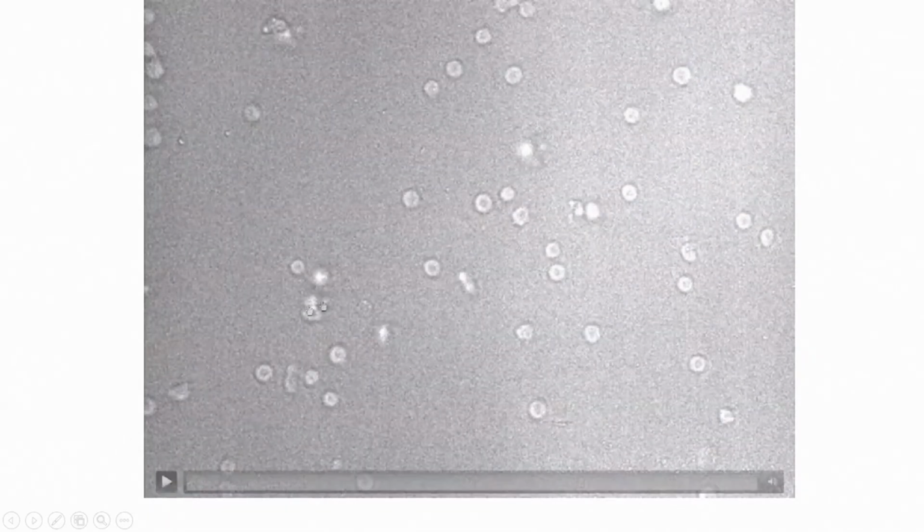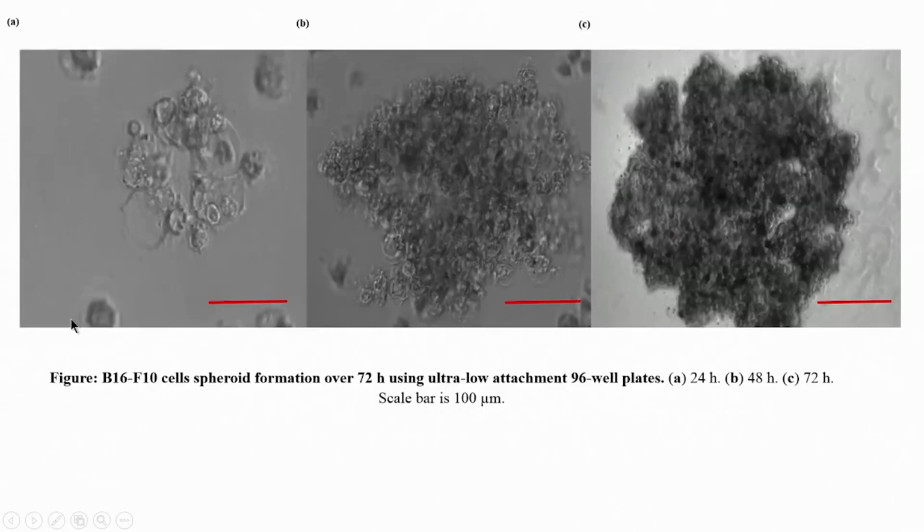Right. So, T cells, these are T cells, and like I said about 4 micron in size. Okay. So, what is the idea?